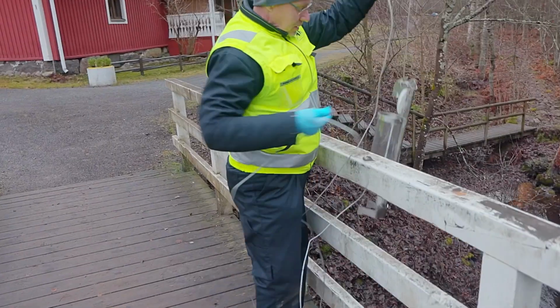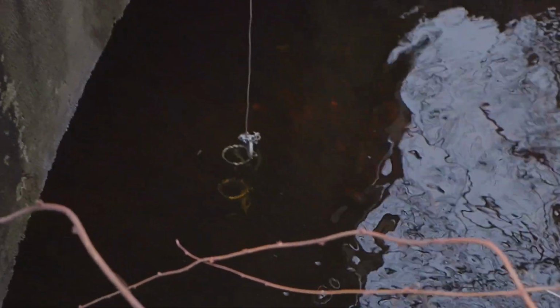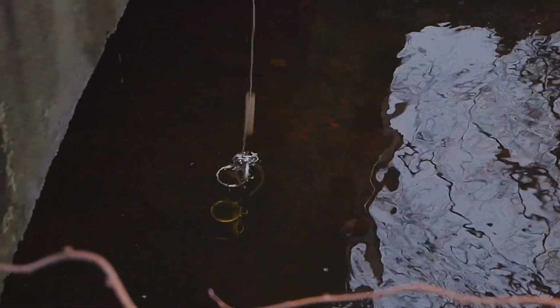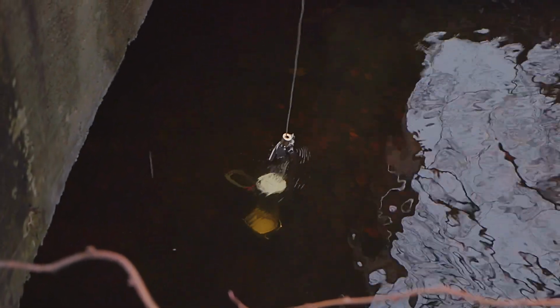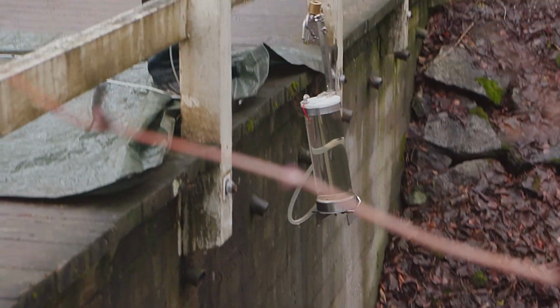The sampler is activated with a weight which closes the hatches, allowing the water sample to be lifted up. In all sampling, it is important to disturb the water as little as possible. For example, sediment that mixes with a water sample contaminates the sample entirely and it no longer represents only the water at the sampling point. Such a sample should not be analyzed.